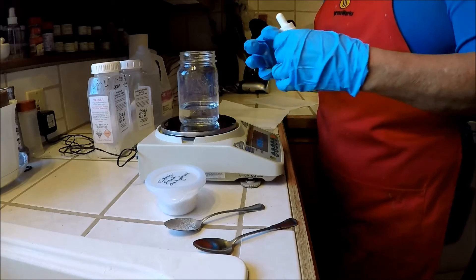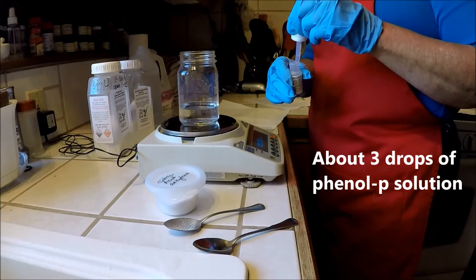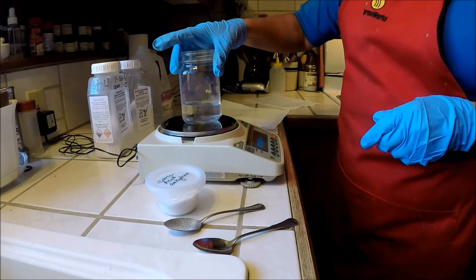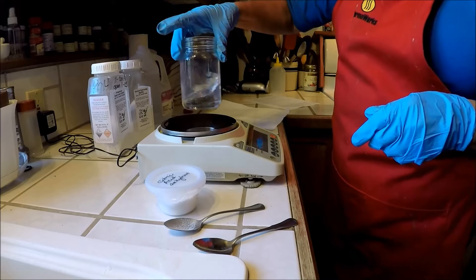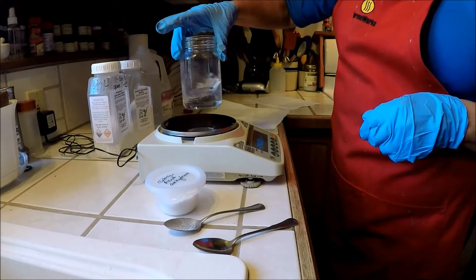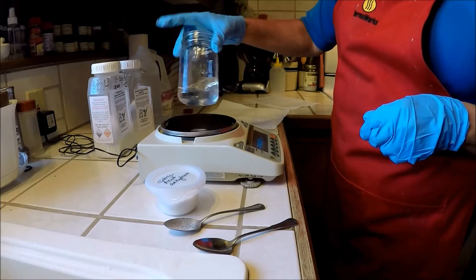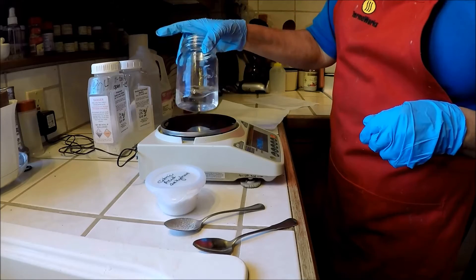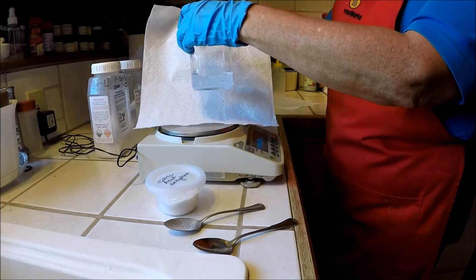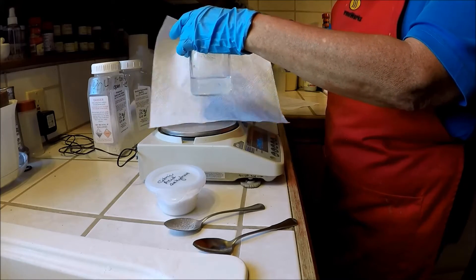Now I'm going to take my phenolphthalein solution and put about three drops in it. And when I say about, that's really all I mean — about three. I'm going to swirl this. I'm not going to use a spoon or a chopstick or anything to mix my solutions because I don't want to introduce any more error than absolutely necessary. As you can see, the distilled water doesn't show any kind of pink color against this white background. It looks perfectly clear, which is exactly what I would expect.